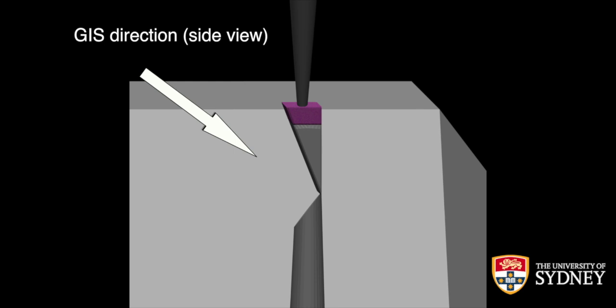On my webpage, you'll also find a little bit of a guide to the different deposition conditions and different deposition materials. But of course, the cleaner your deposition material is, the stronger your deposit will be. So platinum: easy to deposit, but also the weakest welds. Tungsten hexacarbonyl: a lot more difficult to deposit, you need to be very careful about the geometry. But if you get the position right, the welds will be very, very strong and will have very good survival rates.